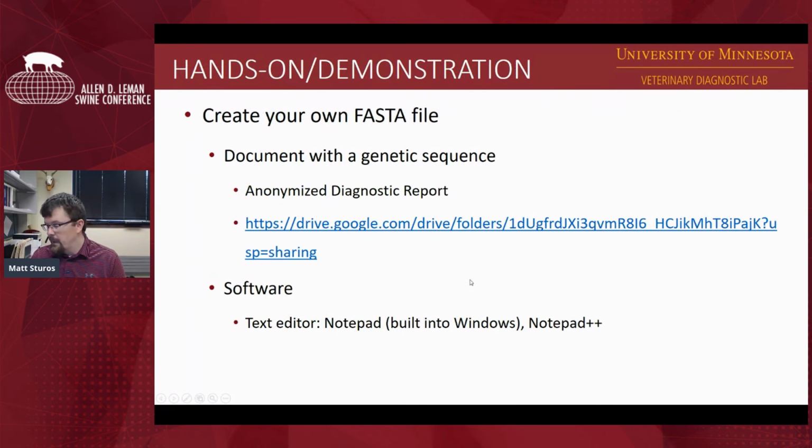So now we've come to, as Jerry said, my part without a safety net. This is the hands-on or demonstration part of it. I don't know who has or hasn't done this type of thing. Oftentimes I get a query: can you analyze the sequence? And I say, sure, send me the FASTA file. And I get a diagnostic report or something similar. So I'm going to walk through how to create your own FASTA file. It's fairly simple.